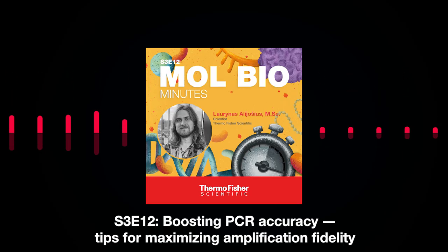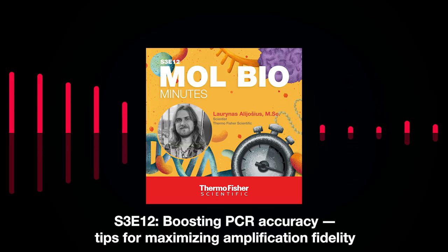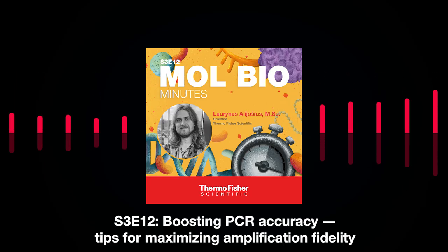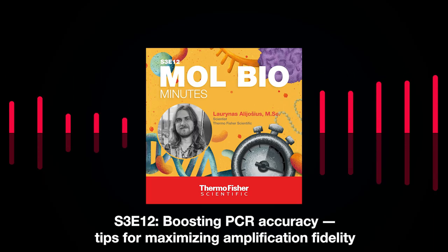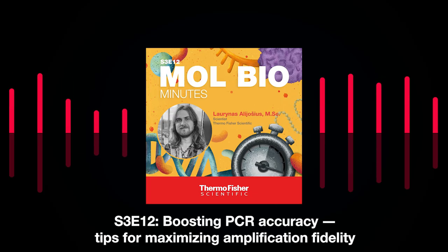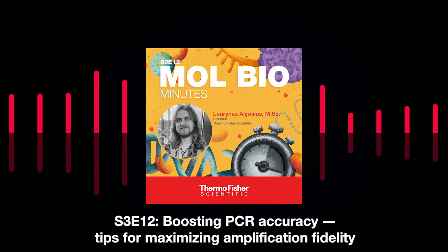So, for example, if your primer design is a bit poor, that can lead to some unwanted processes like formation of primer dimers or primers binding to the template in a non-specific fashion, or primers can be just too short, and that would mean that they could bind to some non-specific locations on your DNA template and the wrong sequence could be amplified.